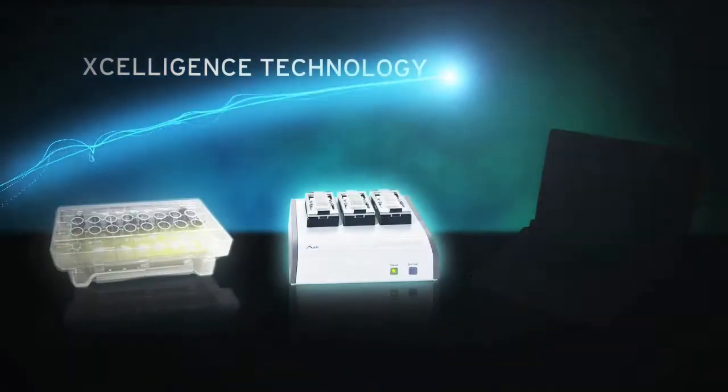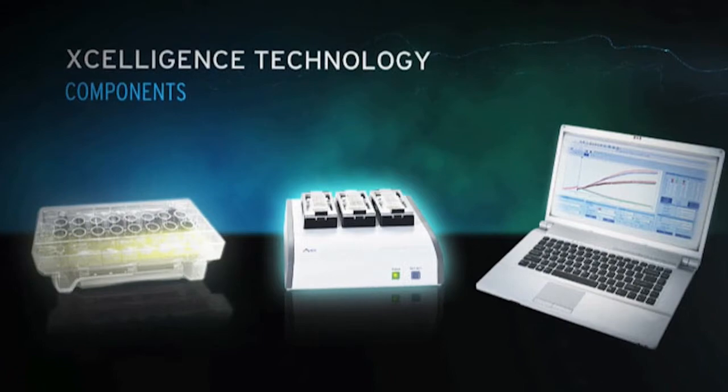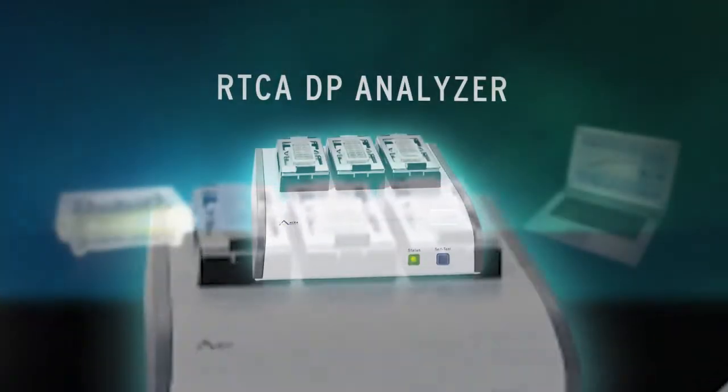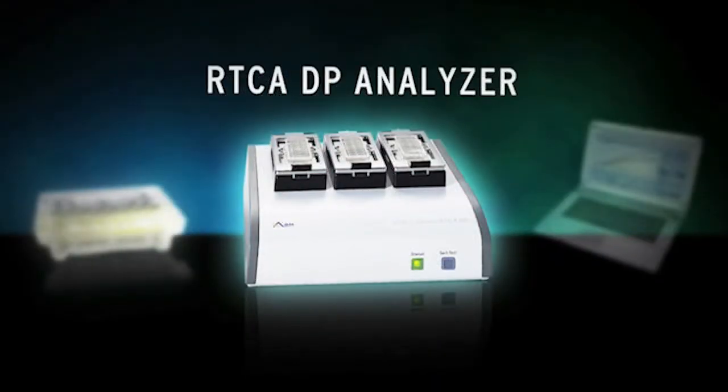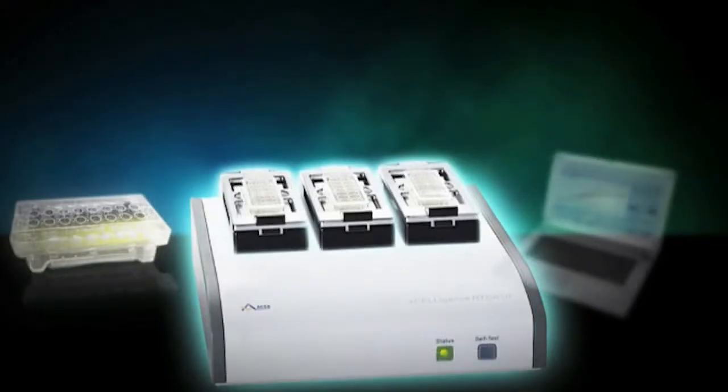Let's look more closely at all the components of the Acceligence system. Sized to fit inside a standard tissue culture incubator, the RTCA DP analyzer provides stations for three 16-well E-plates. Stations are fully integrated, but can also work independently.